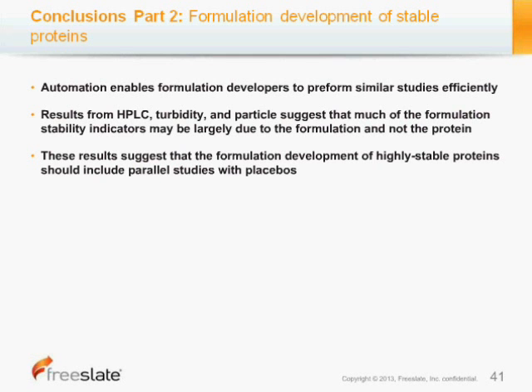And that's obviously a mild suggestion because this is one of our first studies of highly stable proteins using this platform. But one thing that is for sure is that with the placebos, and I did create placebos in addition to the formulations, the automation allows you to perform the analyses of the placebos and the formulations in parallel if one wishes.